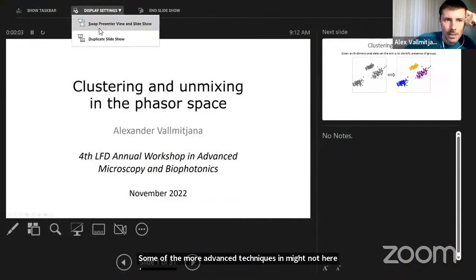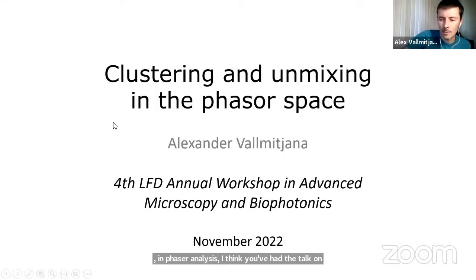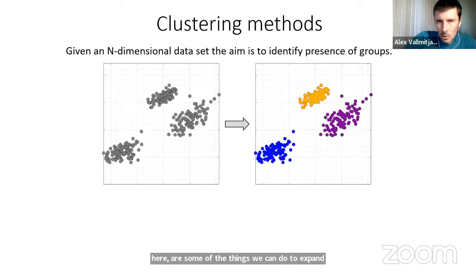In phasor analysis, I think you've had a talk on FLIM phasor, a talk on spectral phasors, and here are some of the things we can do to expand the work on phasors. So I'll be talking about clustering. I'll be talking about the multi-component analysis methods that Lionel was mentioning in his talk.